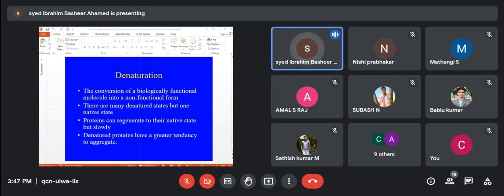In the UV spectrophotometer, Subhas told around 280 nanometer, you can measure the absorbance. So I'm putting another question. In case my protein doesn't have aromatic amino acids, the phenylalanine, tyrosine, tryptophan, these are the three aromatic amino acids which absorb around 280 nanometer. Not all proteins have these three amino acids. There are some proteins which do not have these aromatic amino acids.